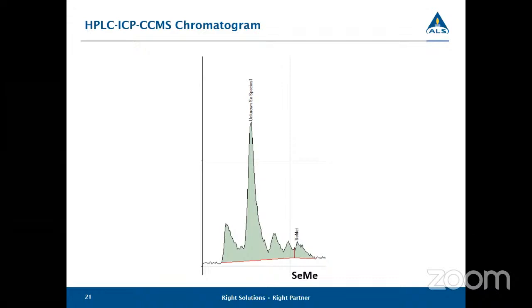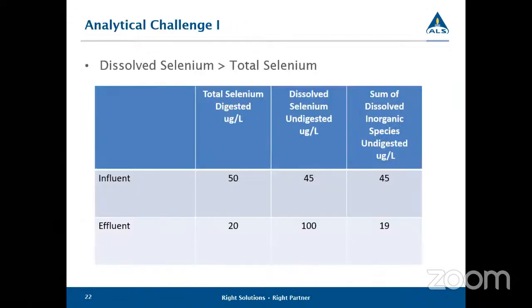But what use does selenium speciation have? Well, I'm going to give two examples, two case studies where this has helped clients and helped us understand what is going on in the environment.